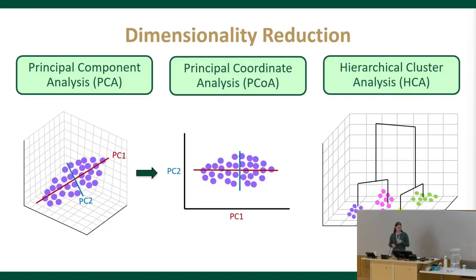The three main techniques that we employed throughout this project were principal component analysis, or PCA, principal coordinate analysis, or PCoA, and hierarchical cluster analysis, or HCA. All of the figures that we generated using these techniques were made in our statistical software using the vegan package and the ComplexHeatmap package.